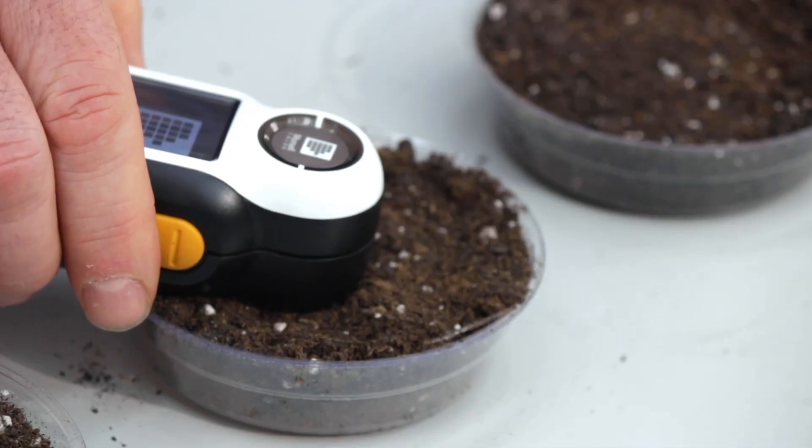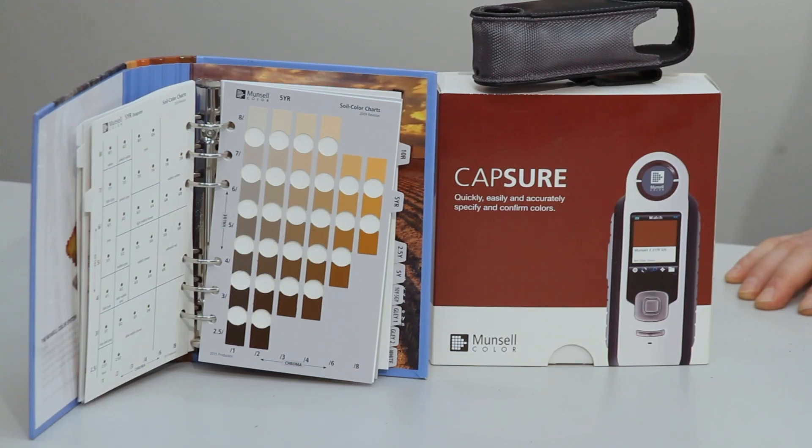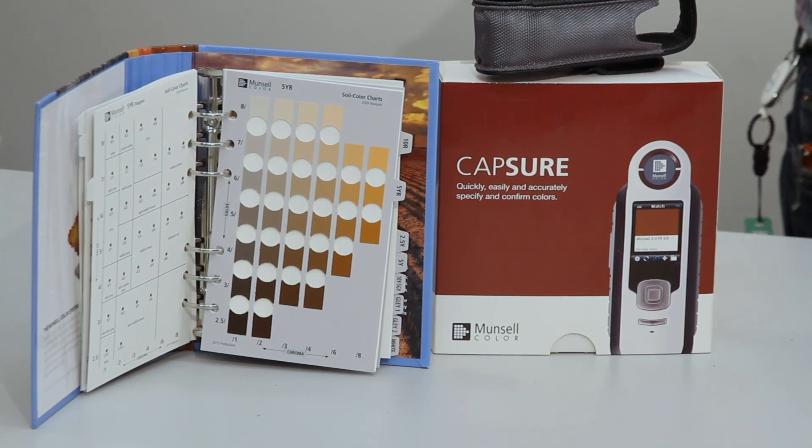I'm here today to talk to you about the Munsell soil color capture. This is basically an electronic device that will allow you to measure and capture the color of the soils that you're working with. It has all the colors from the Munsell soil book inside of it, so you can accurately and quickly assess the color of the soil.